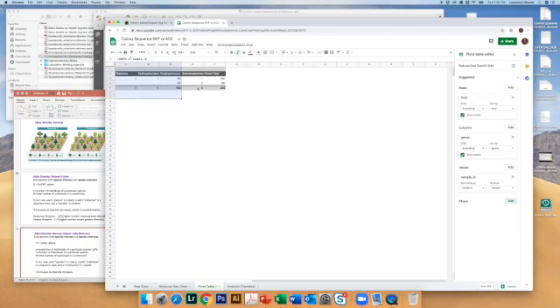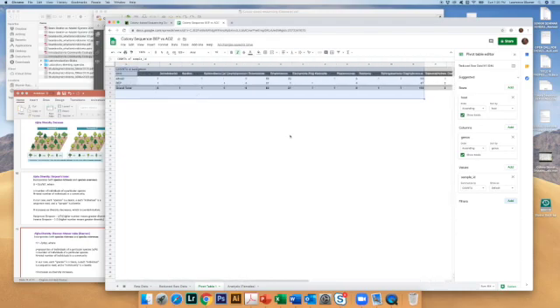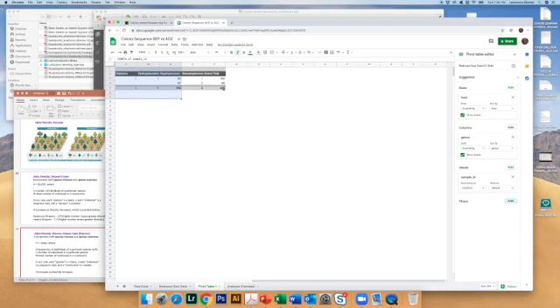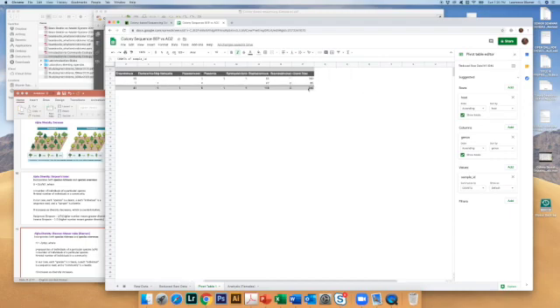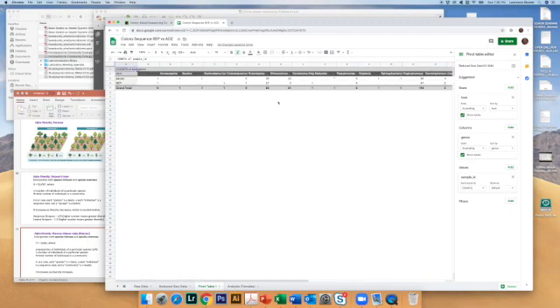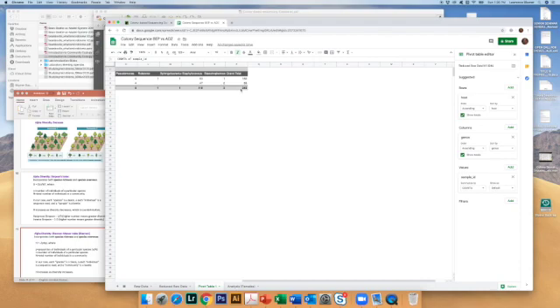We've actually added another genus because there was a genus that was in males. Well, actually, I don't know that. I take that back. We certainly have a larger sample size, 245 values. We could do the analysis on the entire data set, and that might be worth doing to see if you get something different. There are some genera that might not have been seen before, but again, this pivot table has to be copied and pasted in as values only before you can do anything else.